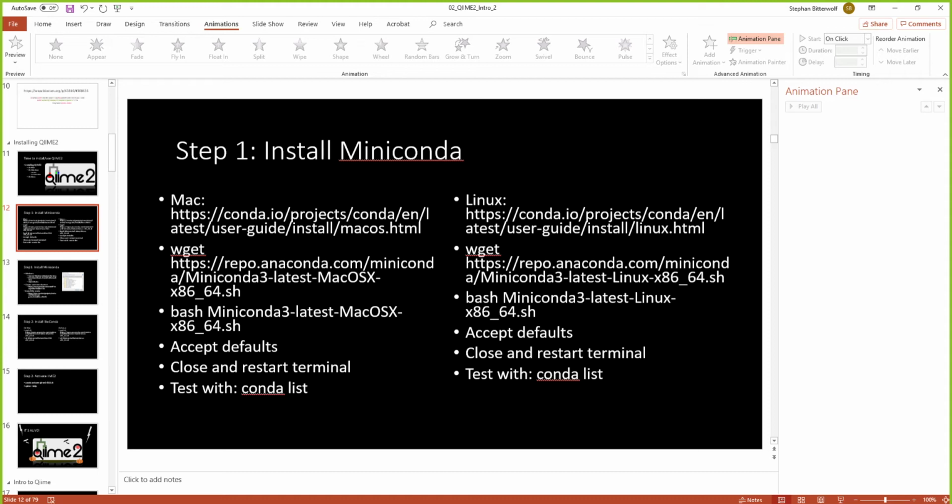So who doesn't have Miniconda going yet? Is it just Lauren so far? So Stefan, I have Miniconda, but I have it like Miniconda 2. Is there a difference? Should I try getting Miniconda 3? If you have Miniconda 2, then the update of Miniconda is going to be an easier thing to do. So you don't have to download anything. There's a code that you run, I think, in Miniconda 2. Yeah, Mary Lou just pasted it. Conda update conda. So just run that command and see.